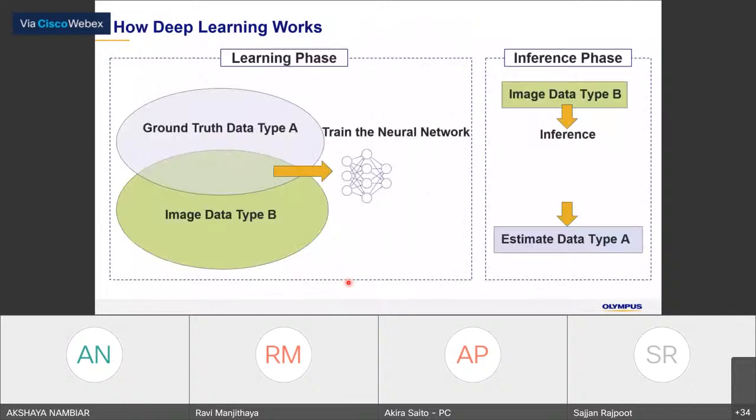So I would briefly introduce how deep learning works. For deep learning, we need to create a neural network, something like our brain, to understand what the images are and where the objects are.